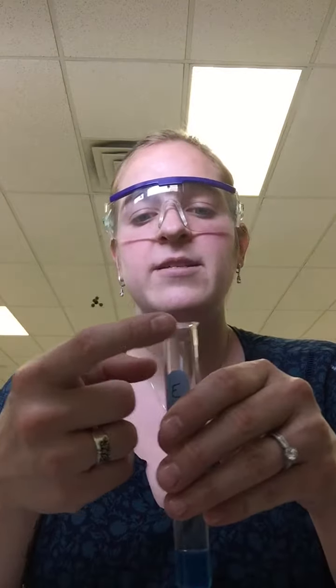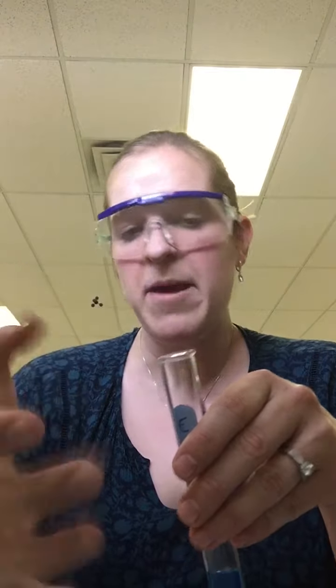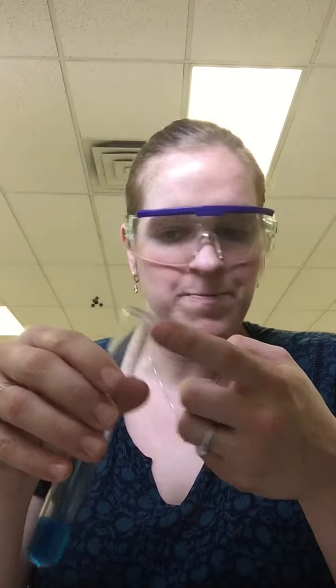I did tell Corbin this yesterday, so maybe he told you guys, but sometimes there's a residue of balloon left on here. Remember, you're taking the mass of this and your beaker. If there's any balloon residue, try to chip it off the side, because that's just going to give you extra mass that can add to your error. Get as much of the balloon off the side as you can. If it corroded, try not to let any of it go in. If it does, it's okay. You'll talk about it in the error section of your lab.